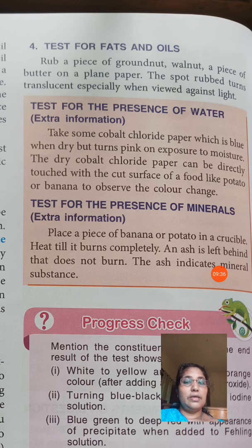Then test for the presence of minerals. As an example, place a piece of banana or potato in a crucible. Crucible is a vessel, a particular vessel. It appears like our porcelain vessel.